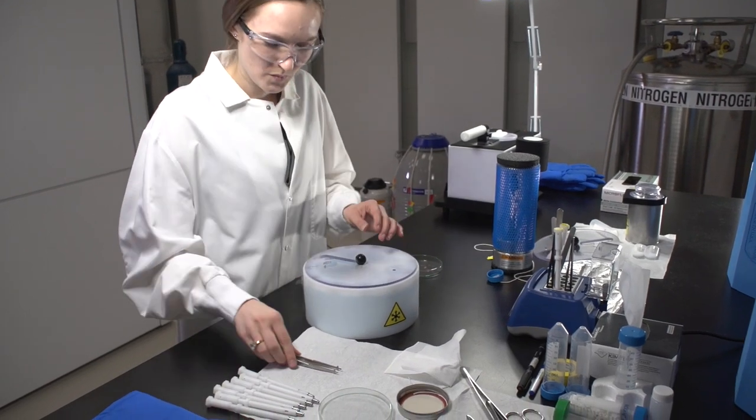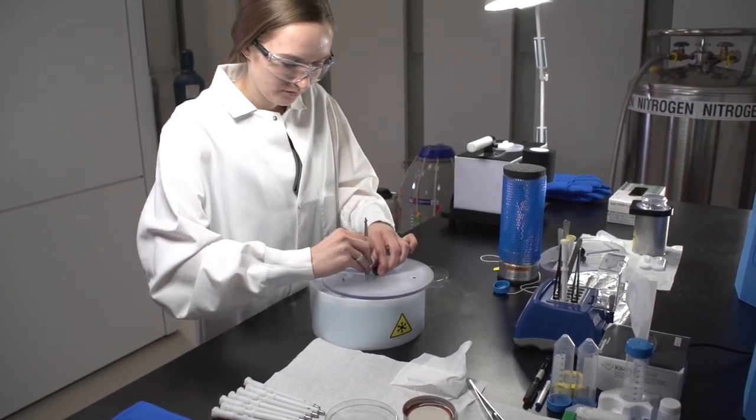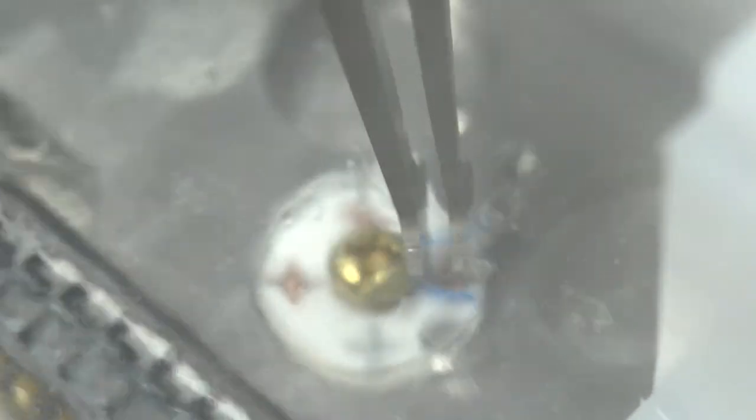The following procedures are done in liquid nitrogen while carefully preventing contamination from atmospheric water. The EM grid is placed into a cartridge that facilitates robotic handling of the specimen inside the microscope.